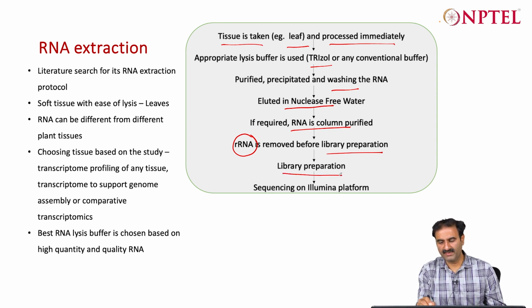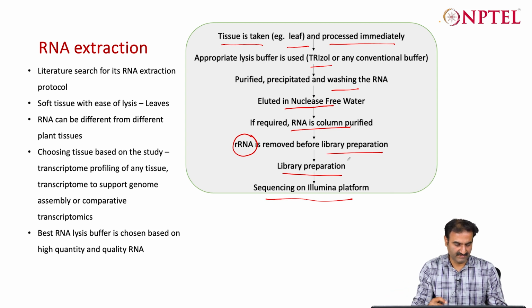Okay, then you go for library preparation and sequencing. In between there should be one more step of converting the mRNA into cDNA, because generally it is the DNA that you sequence in the sequencer.